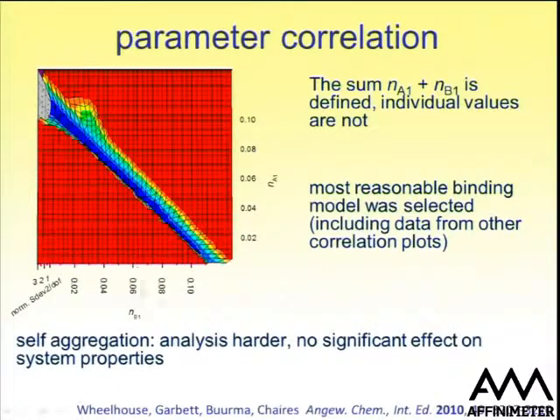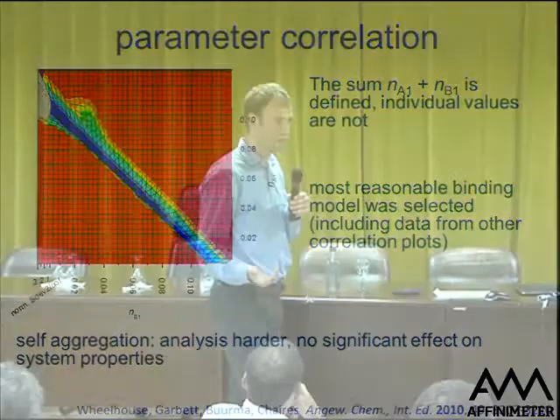If we plot the goodness, or actually badness, of fit as a function of those 2 parameter values, what we get is perfect correlation, this whole blue valley here, where any of the combinations of these 2 stoichiometries gives a good fit. And what that means is that we cannot identify the 2 different stoichiometries. We can only really quantify the sum over those stoichiometries. And this type of plot immediately shows us that it is impossible to identify them individually.